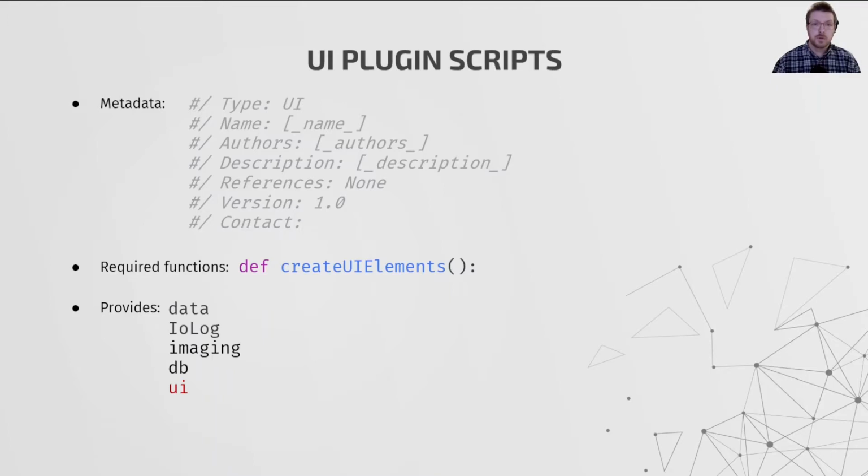When a UI script is evaluated, the objects listed here will be inserted for you to use. Most of these you should be familiar with by now, but there is one new one called UI that we'll talk about next.